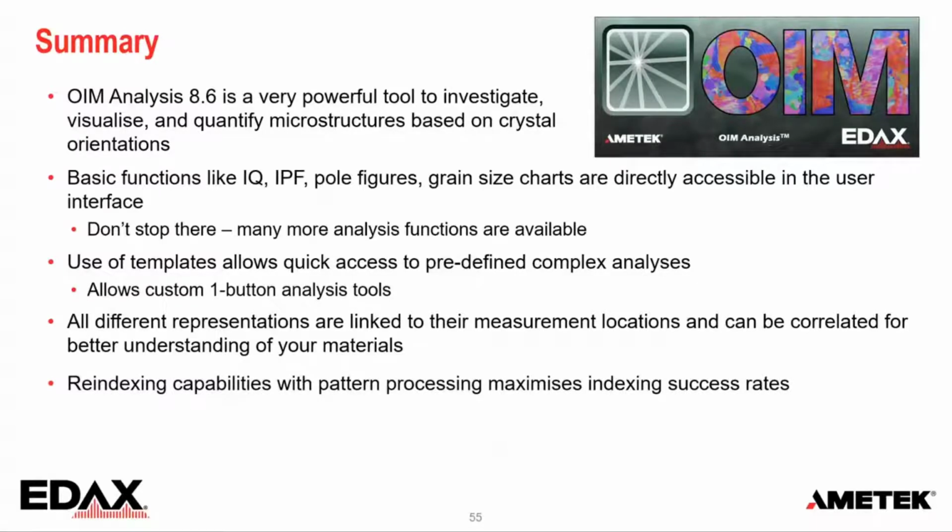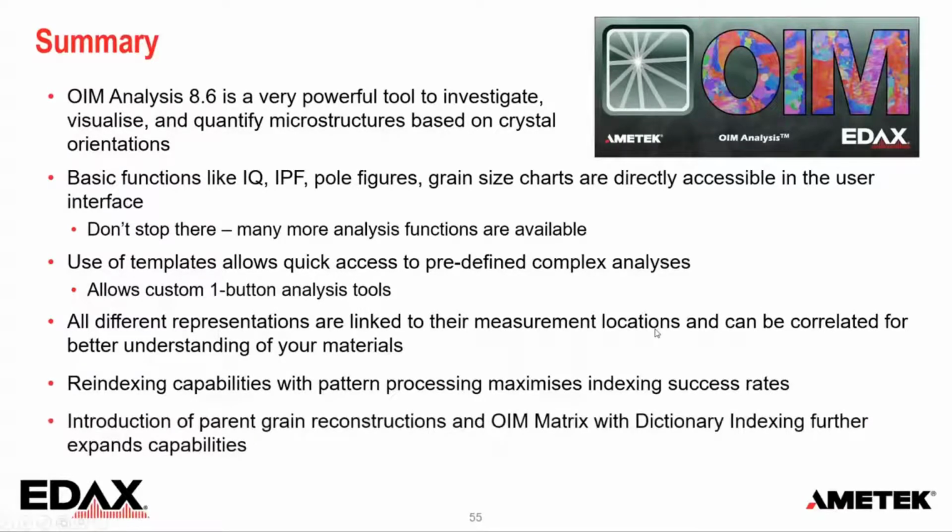And then one of the biggest changes in the last few years actually is the reindexing with the pattern processing with NPAR based on the partitions to really maximize indexing success rates. And the recent introduction of this parent grain reconstruction, OIM Matrix dictionary indexing really helps further the capabilities of the software.